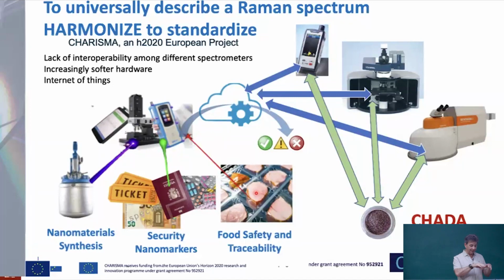By doing that, they avoid liquid water growing on the surface of raw meat. And by doing that, you avoid bacteria growing there. So the raw meat with this kind of plastic can last 50% longer. It can be from 2 to 3 weeks without bacteria. In all these three cases, the active component can be monitored with Raman spectroscopy. So we can monitor how the zeolite is developing until the final point.